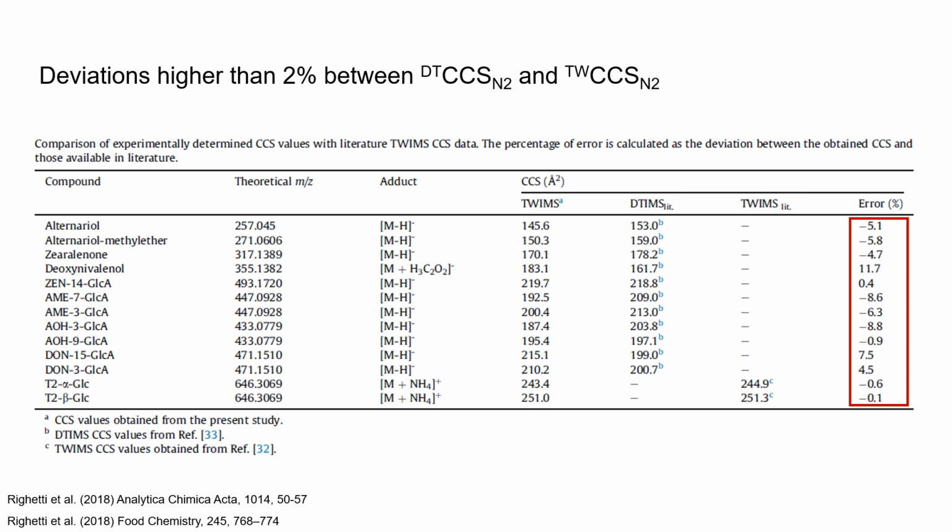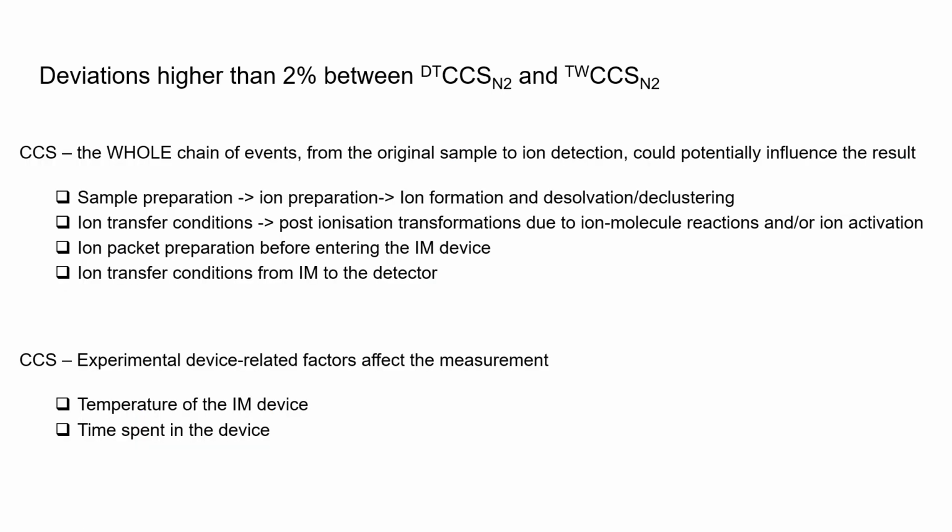It is possible that the different experimental setups influence the derived CCS, because from ion mobility experiments, K0 and CCS depend on the population distribution of ion structures sampled in the experiment. And therefore, if an ion undergoes isomerization or activation, deactivation before or during the IMS separation, the drift time will change, therefore the CCS will change.